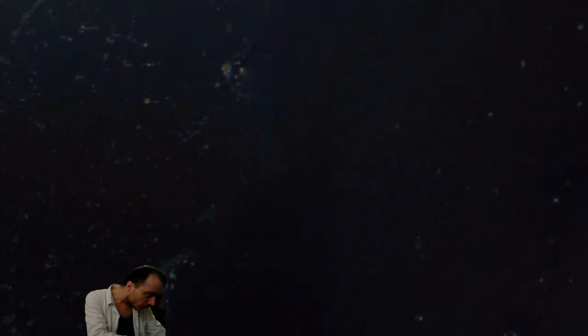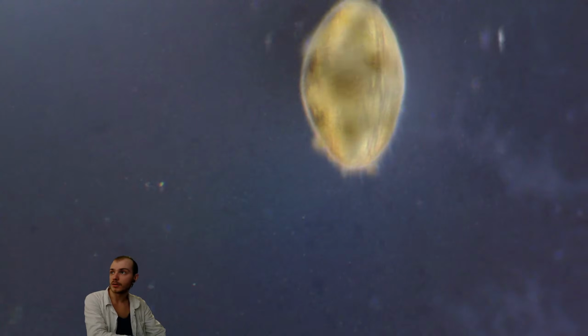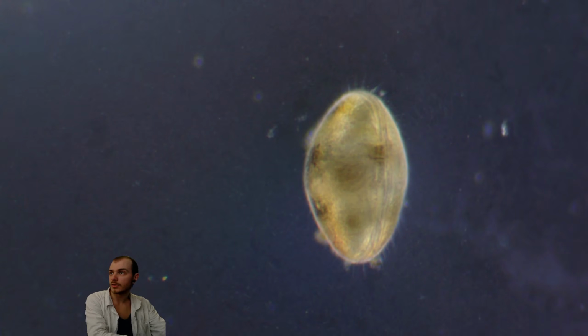So this was the first ostracod. We are going to try to find another one. Where is it? Oh, it's at the bottom. No, this is the smaller one. Already closed.